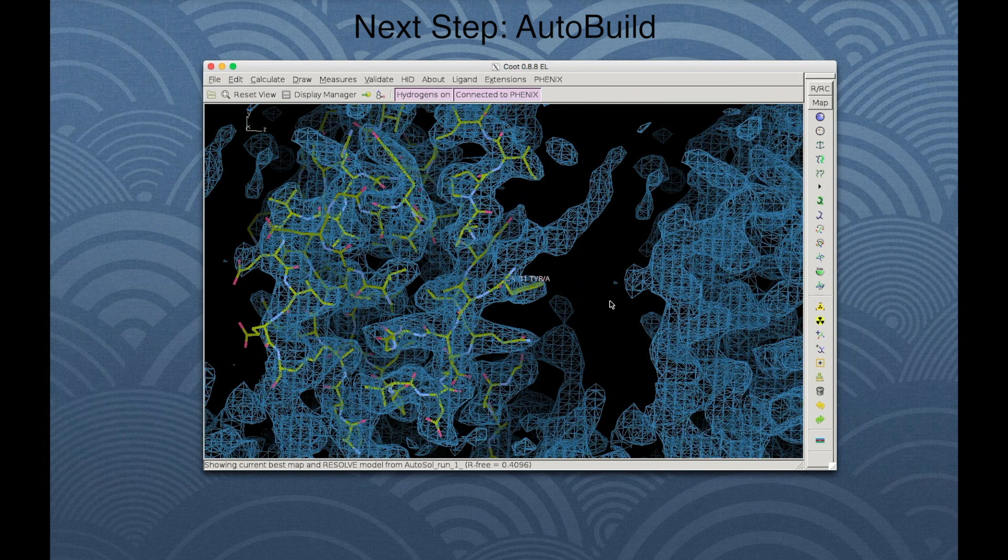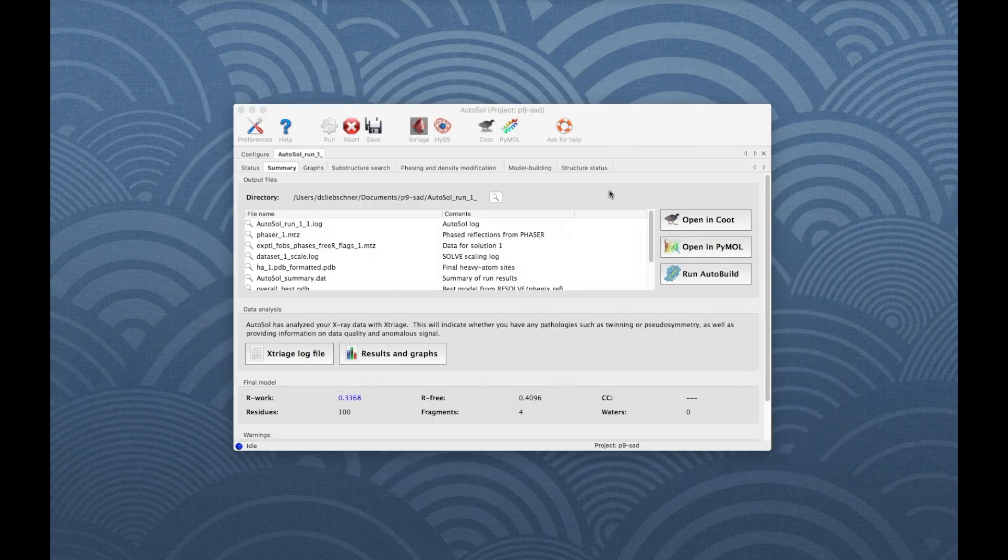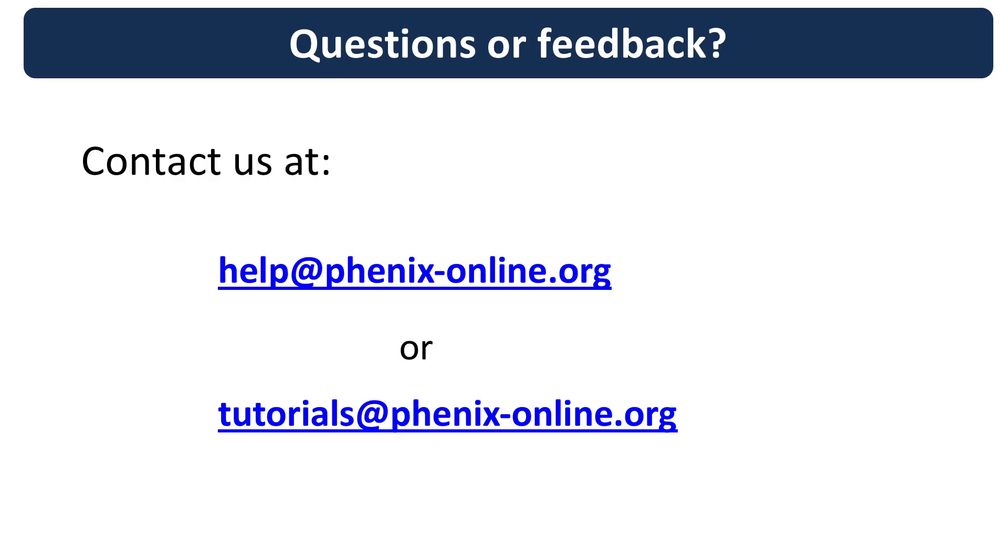The next step is usually to run Phenix AutoBuild, which tries to iteratively improve the map with density modification and build a more complete model. To run AutoBuild with the results of this AutoSol run, hit the Run AutoBuild button in the Summary tab.